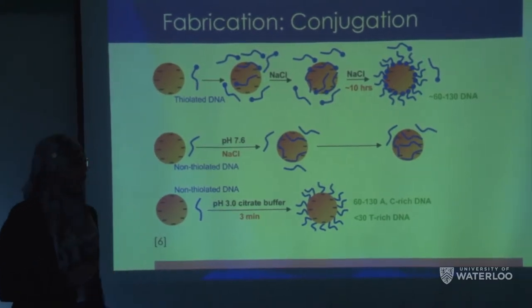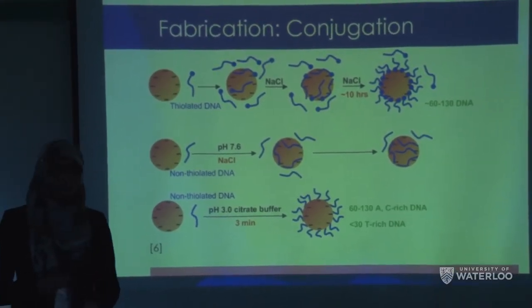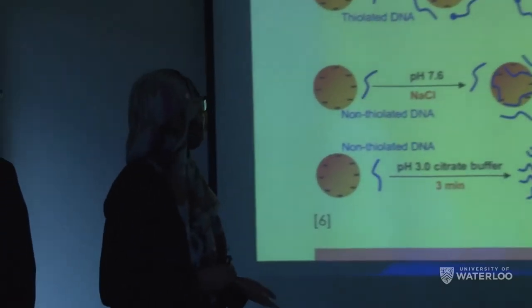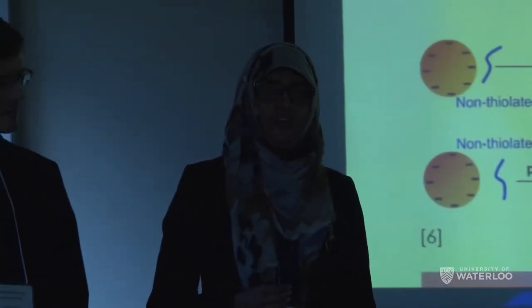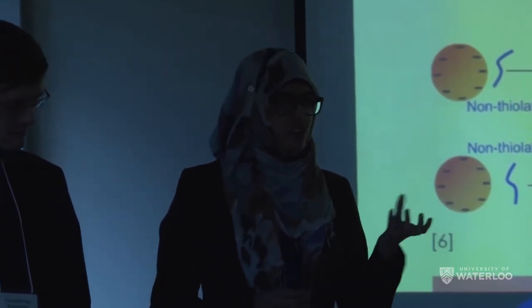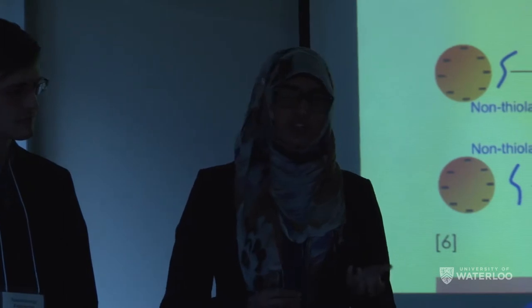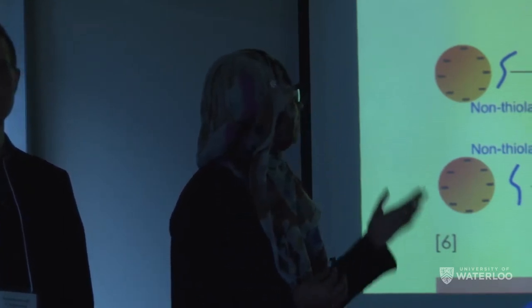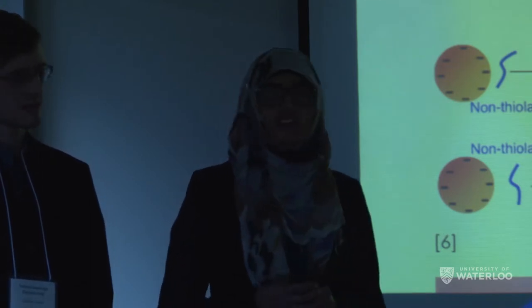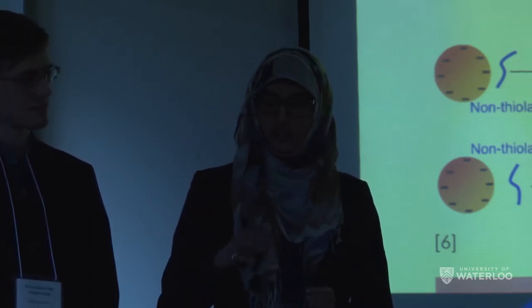So this graphic shows how our DNA is actually conjugated to our gold nanoparticles. The first way that it's been done pretty often is called a salt aging process, and it uses thiolated DNA, or thiolated aptamers. Thiolated just means that there's a sulfur group attached to the DNA. So you can see you basically have NaCl and about a neutral pH as well, and your DNA is able to bind to the gold nanoparticle pretty well.